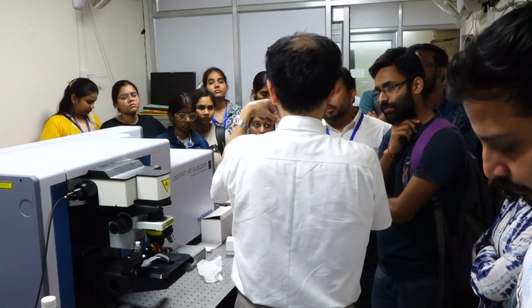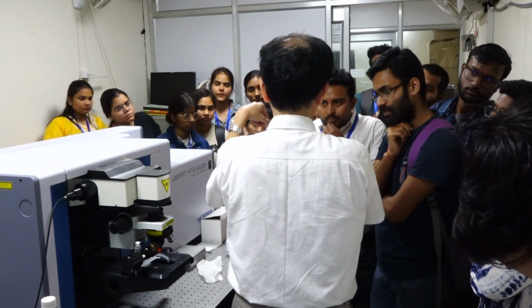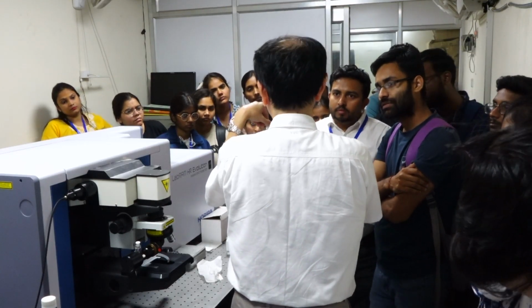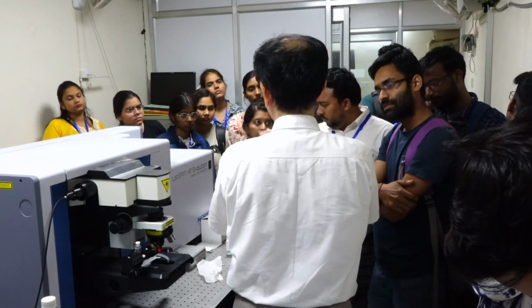One important point is that we need to use pure material. The biggest problem is fluorescence. If there is impurity, it gives fluorescence and makes the quality of the data lower.